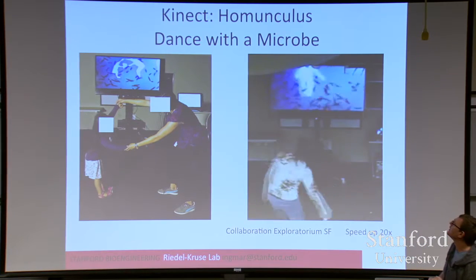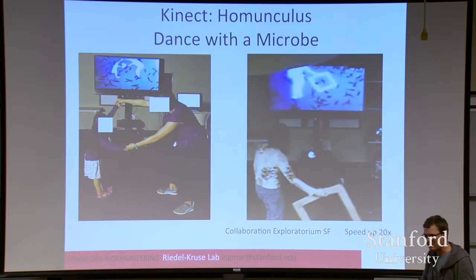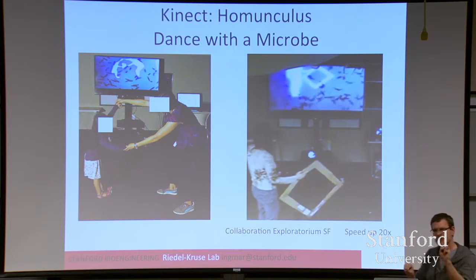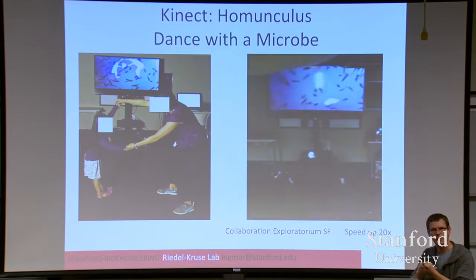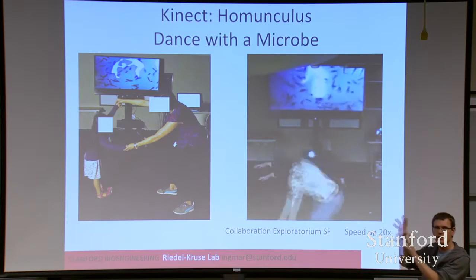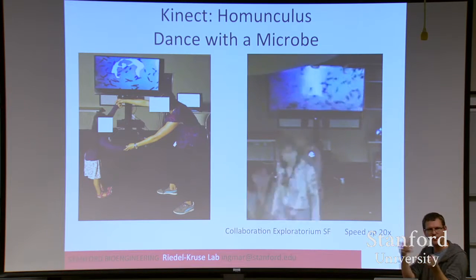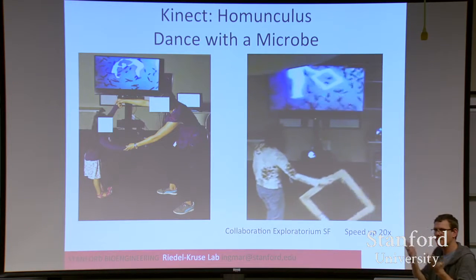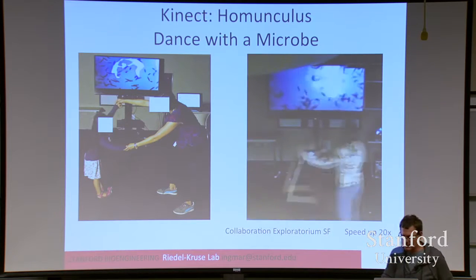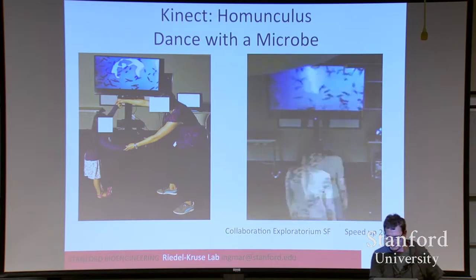And also this picture frame, how you can actually trap a few cells and move them around. One thing I hadn't appreciated before we started this project is that the organisms and the human meet each other in their corresponding worlds, right? You see yourself macroscopic on the screen and the cells at your scale, but if you look through the microscope, you actually see a little person dancing around in there with these cells, and that's what kids like to see. So these are interactive experiences for a museum setting. This is ongoing.